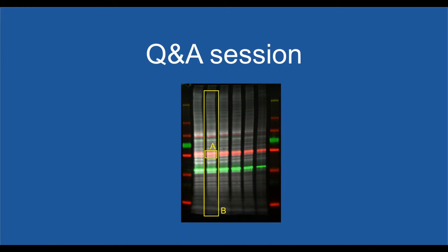Yes, the keyword here is that this total protein stain will normally use a fluorescent channel, because a fluorescent channel will give you very reliable signals, and they are at very different wavelengths. If you're doing a fluorescent Western, it wouldn't be an issue here, because your protein of interest will be detected in a different channel, right? Chemiluminescent is also the same thing.